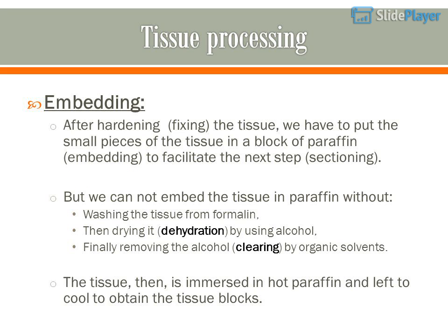Tissue processing, embedding. After hardening, fixing the tissue, we have to put the small pieces of the tissue in a block of paraffin, embedding, to facilitate the next step, sectioning.